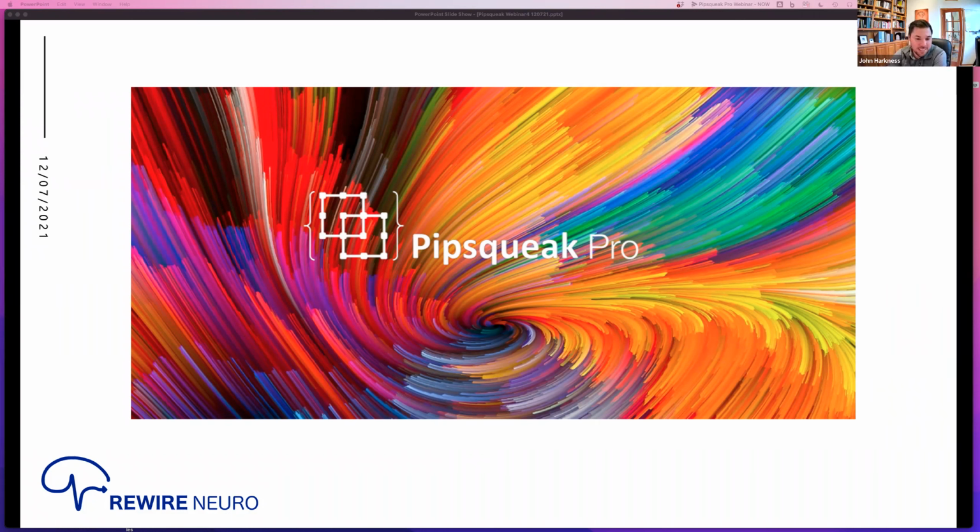We'll just give it another second here to let everyone else come and join us. And then we'll get underway. Generally today, I'm going to walk through some of the new features that we have in Pipsqueak Pro and give you a link to download it and try it yourselves, and answer any questions. I'll try to make this pretty to the point today. I don't want to eat up your whole hour. So we'll get through things here pretty quickly and then answer any questions that you have.